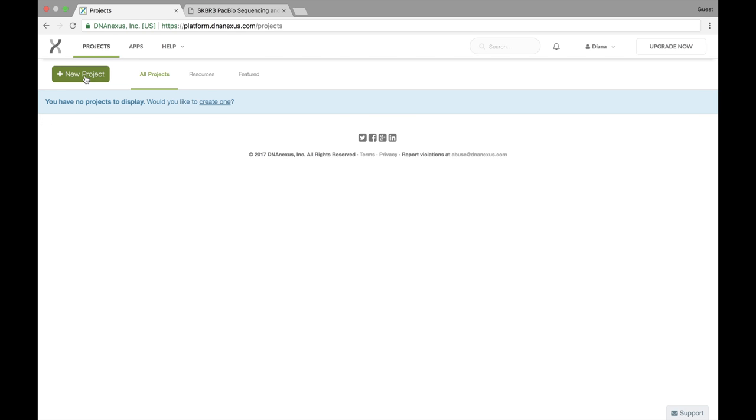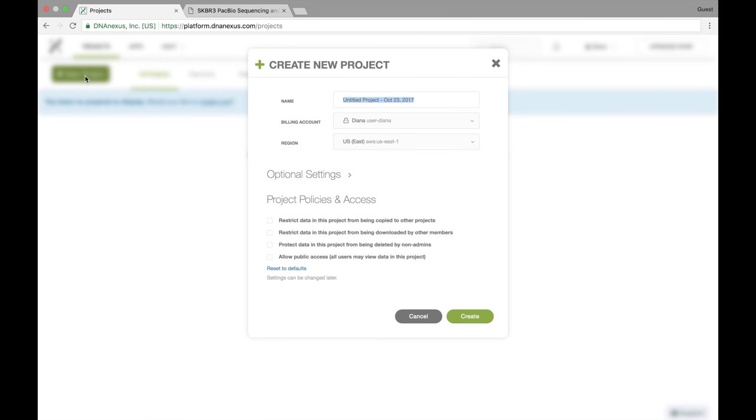The first thing I'm going to do is create a new project, and I'm just going to call this project SKBR3 because that's the cell line I'm studying.